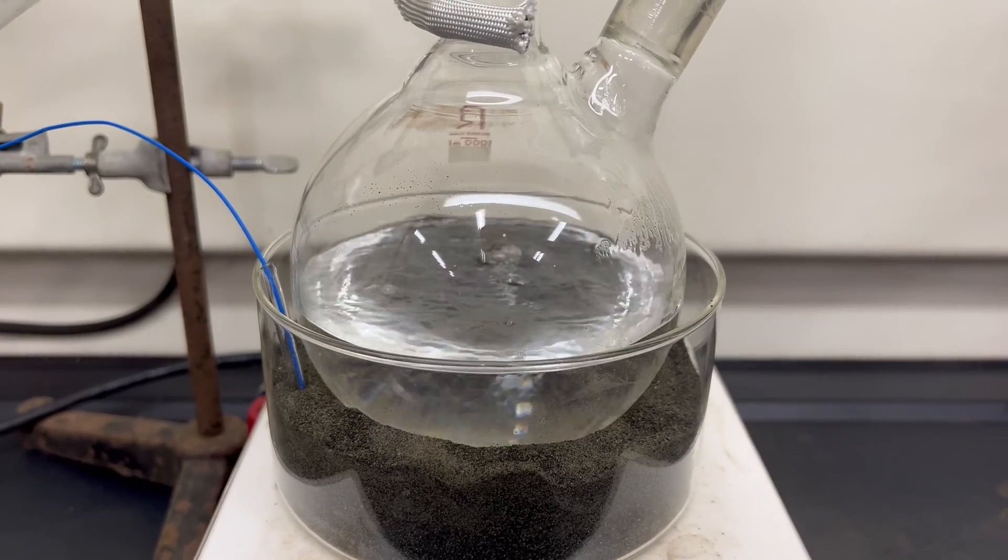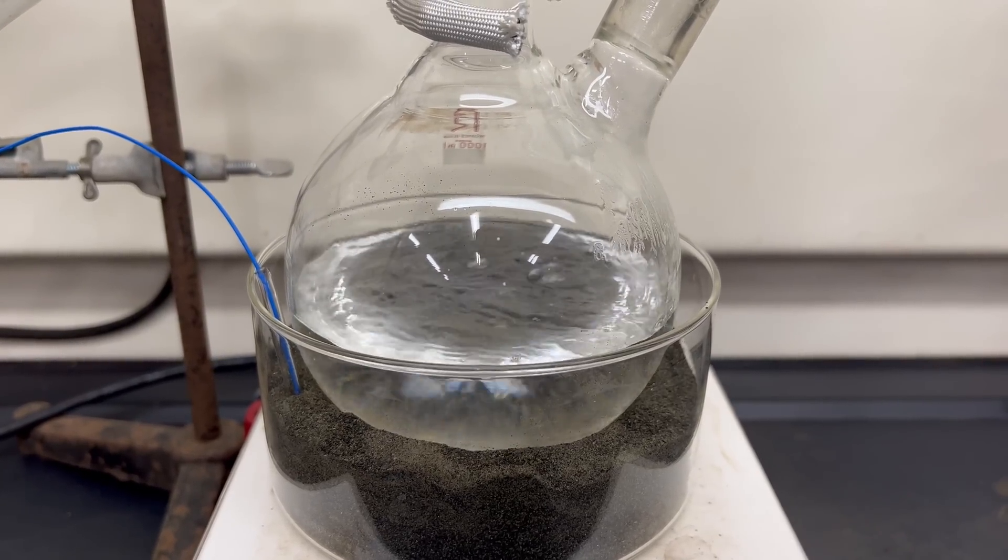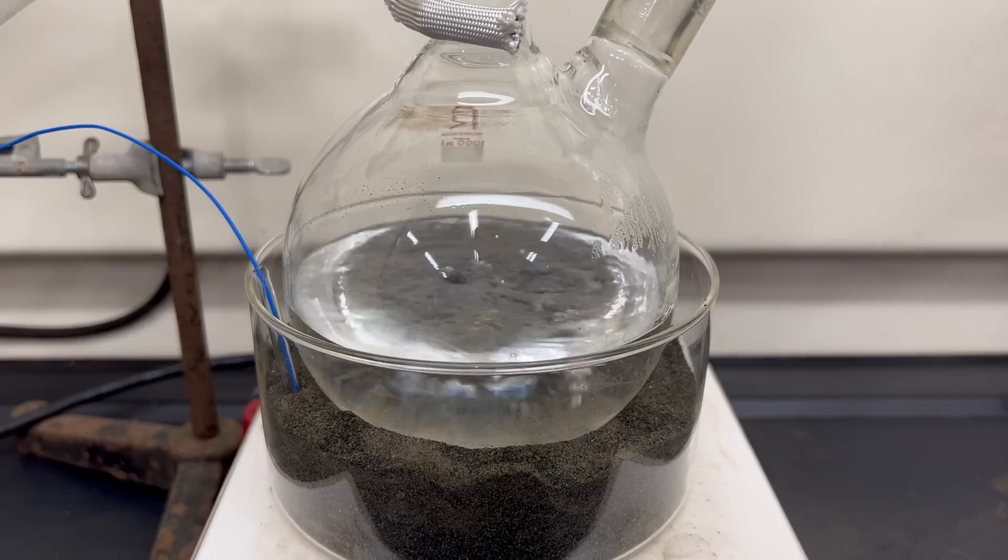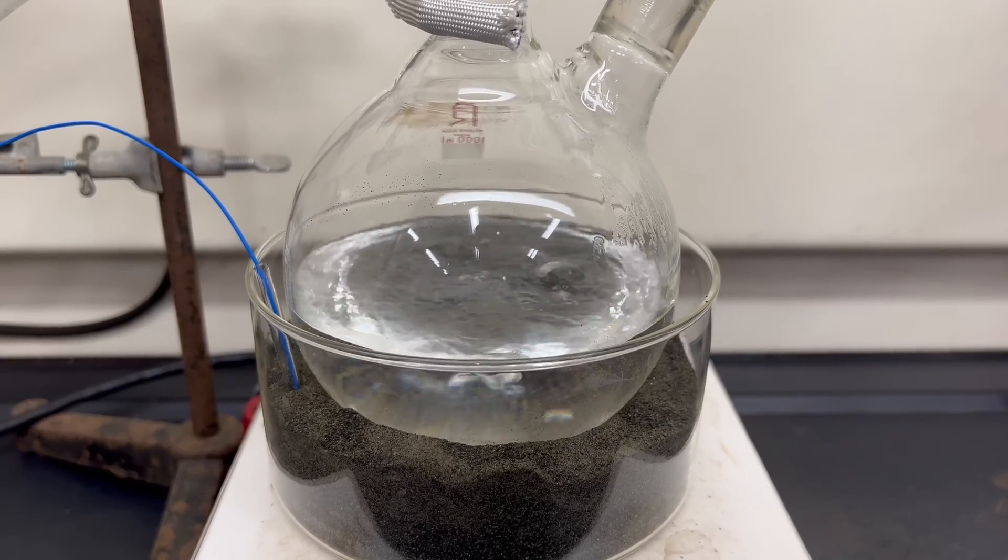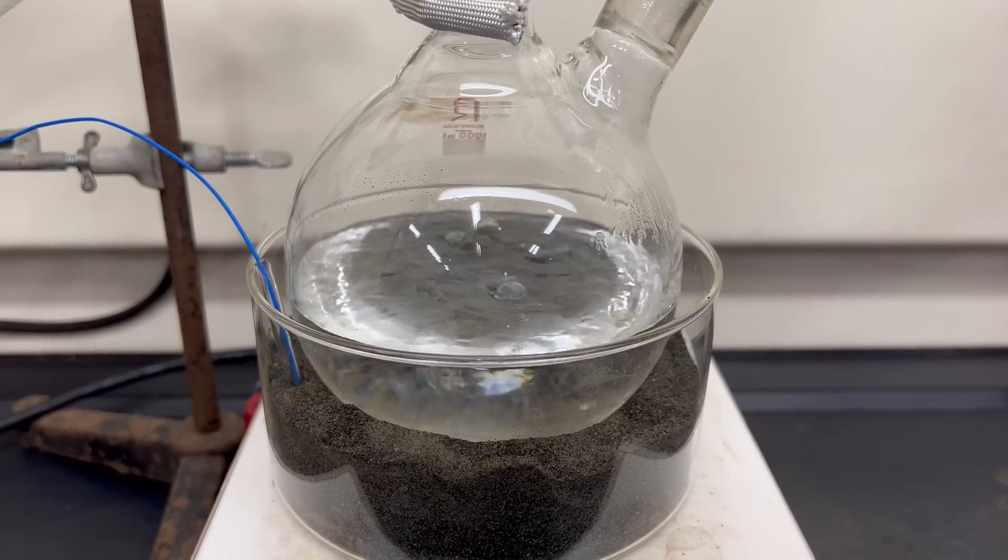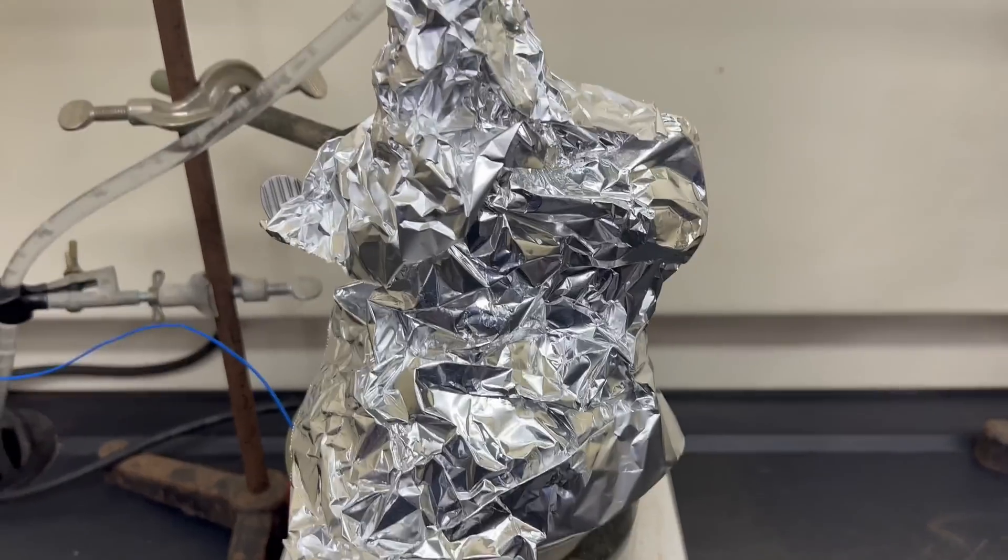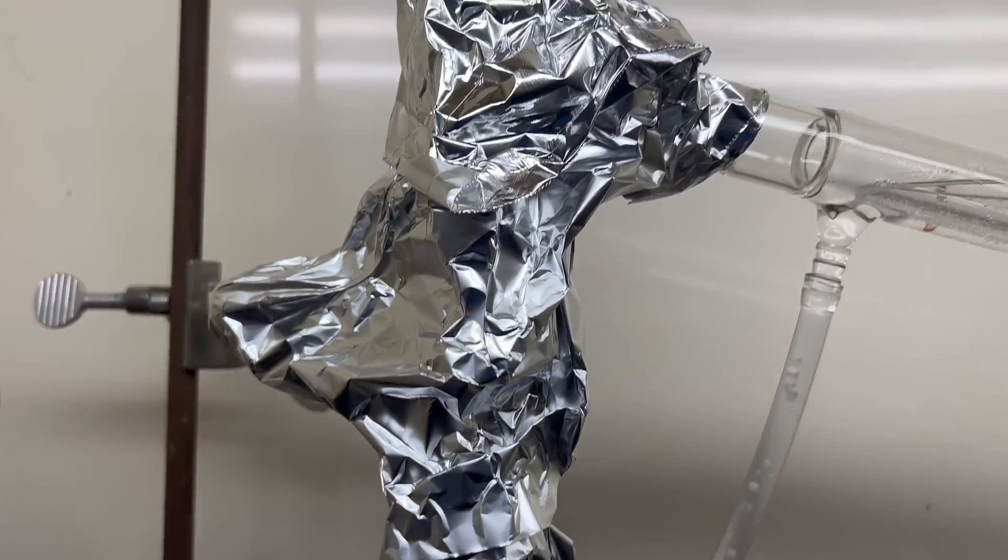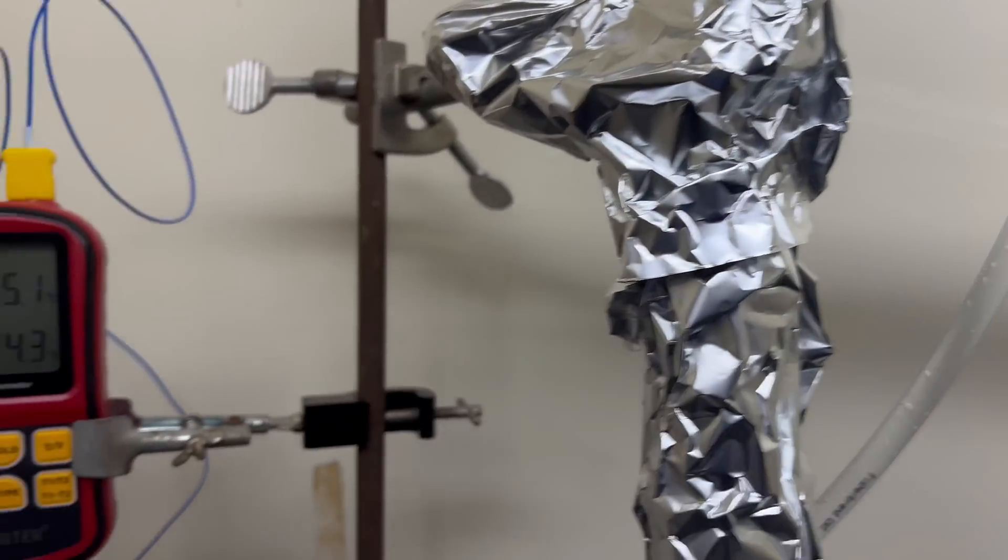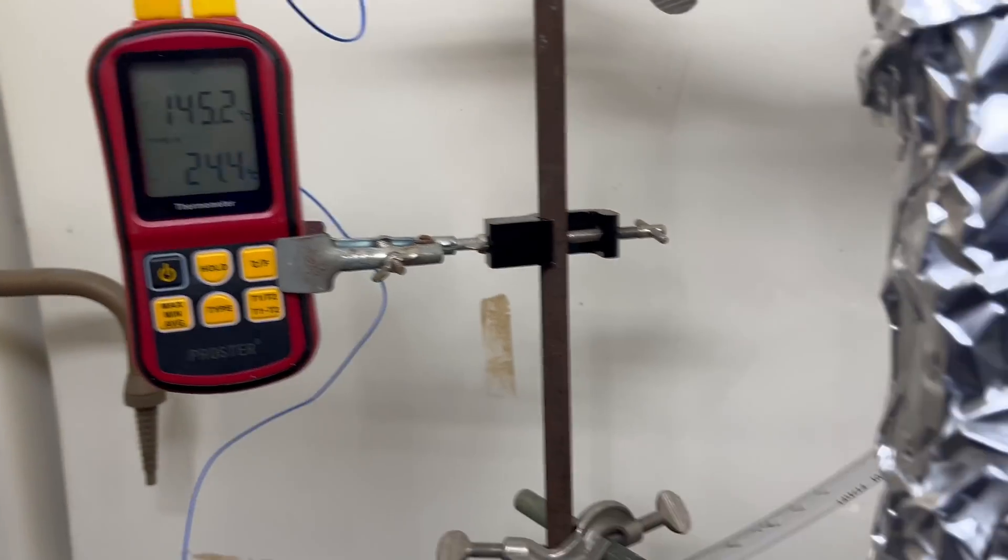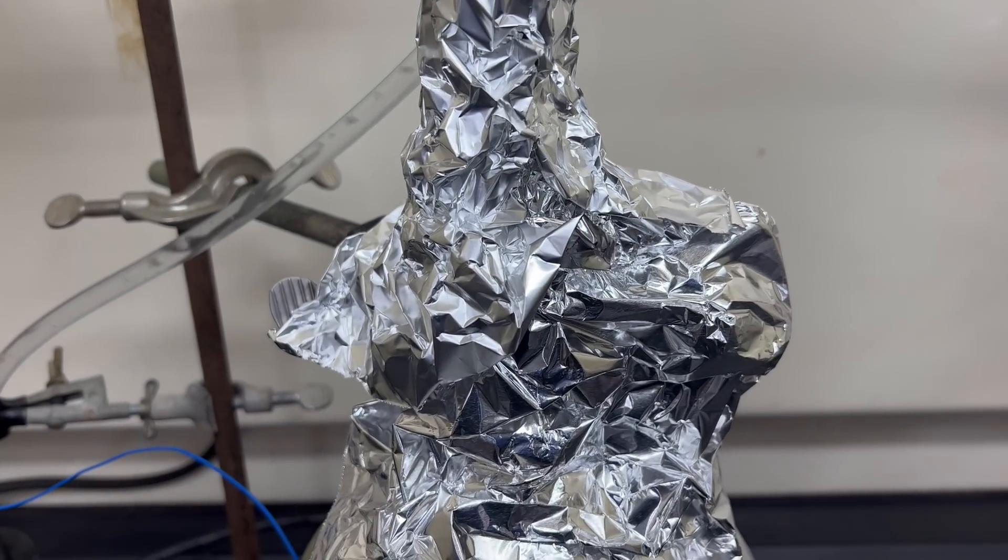Fractional columns suffer from cooling down too quickly. We can avoid that by wrapping them with aluminum foil to keep the heat in. So that the foil keeps the heat in and allows the vapor to reach the top, where it is then condensed.